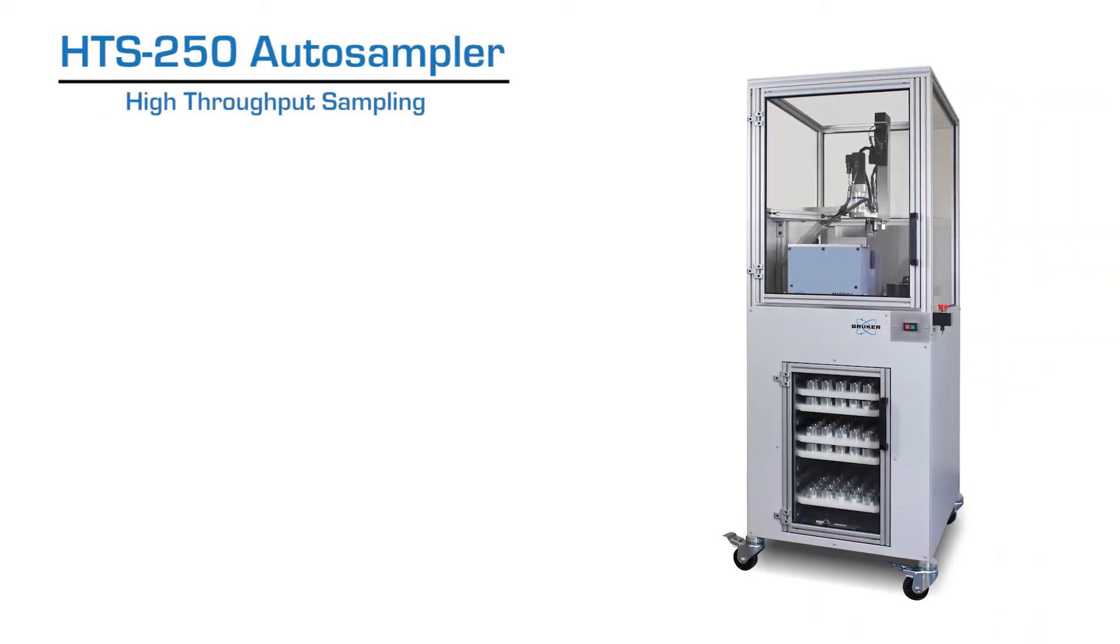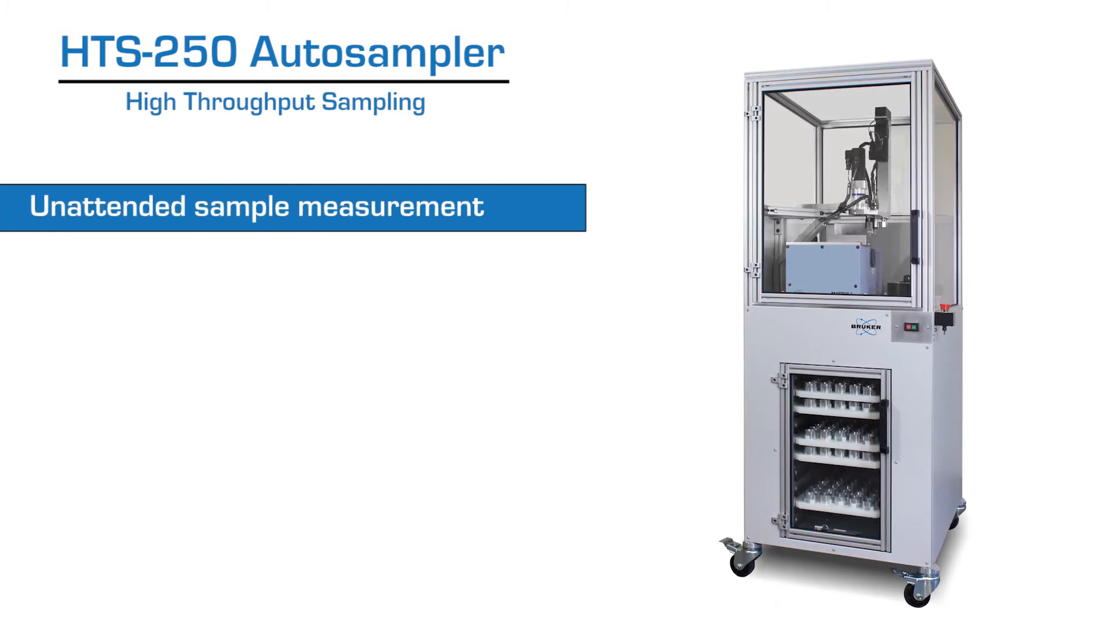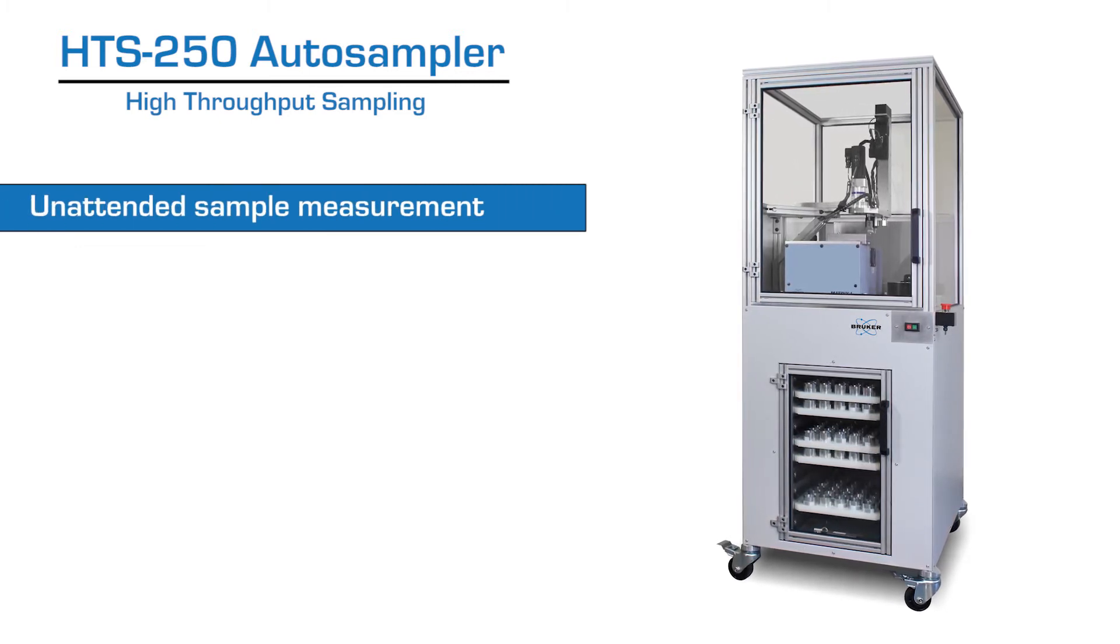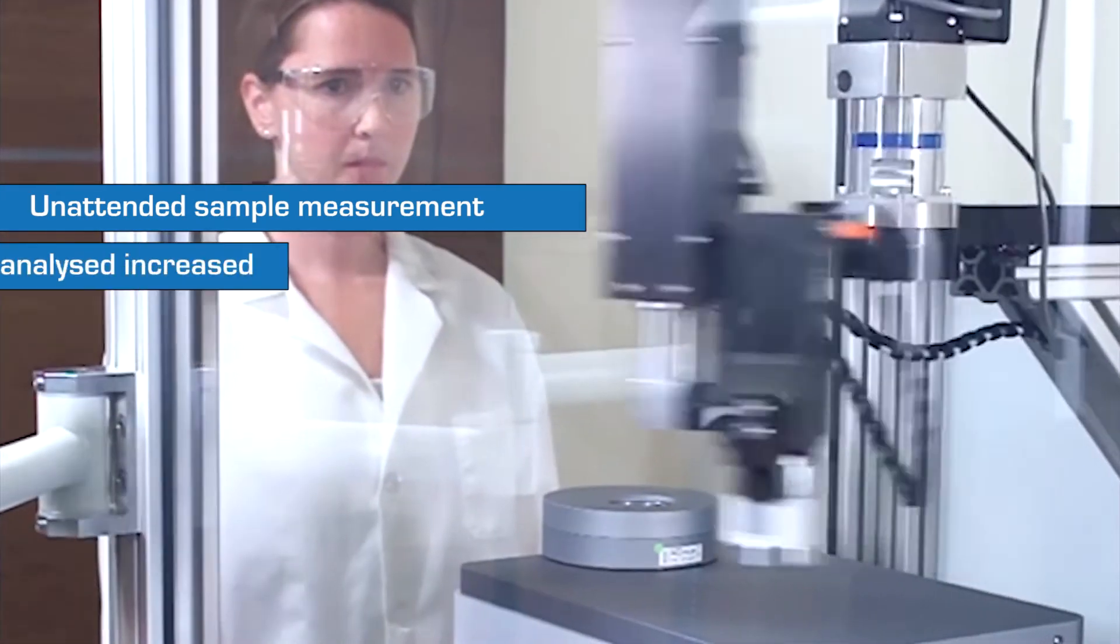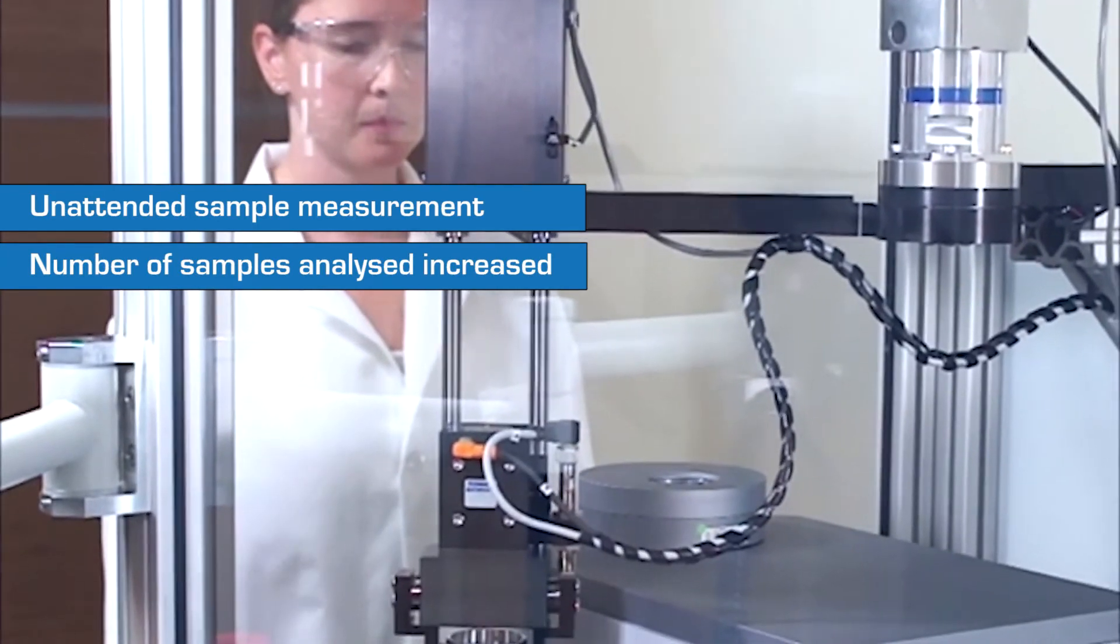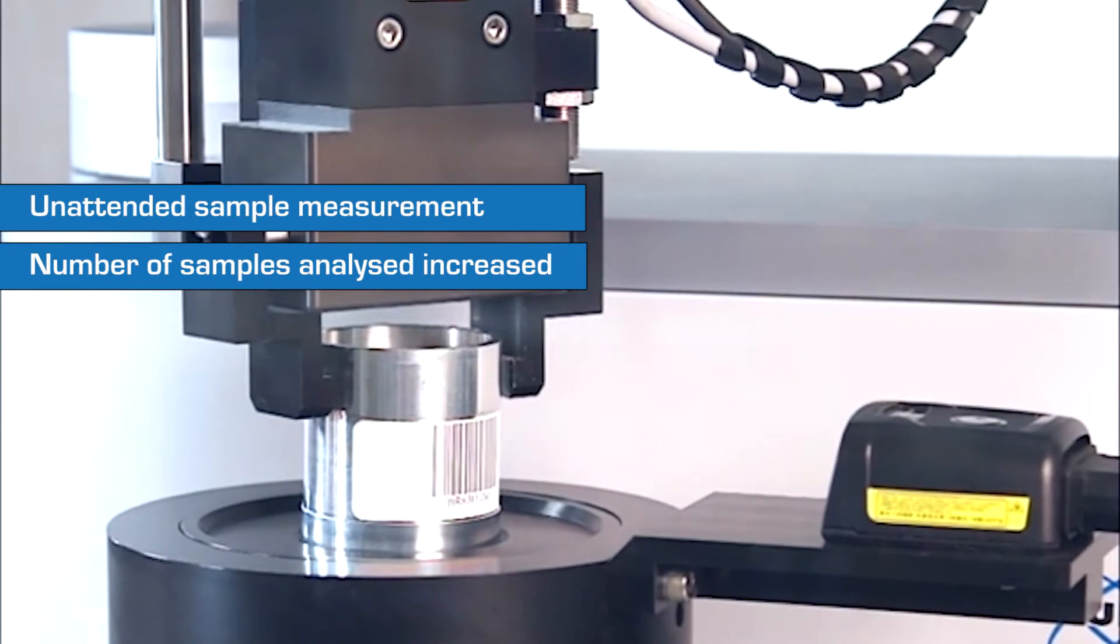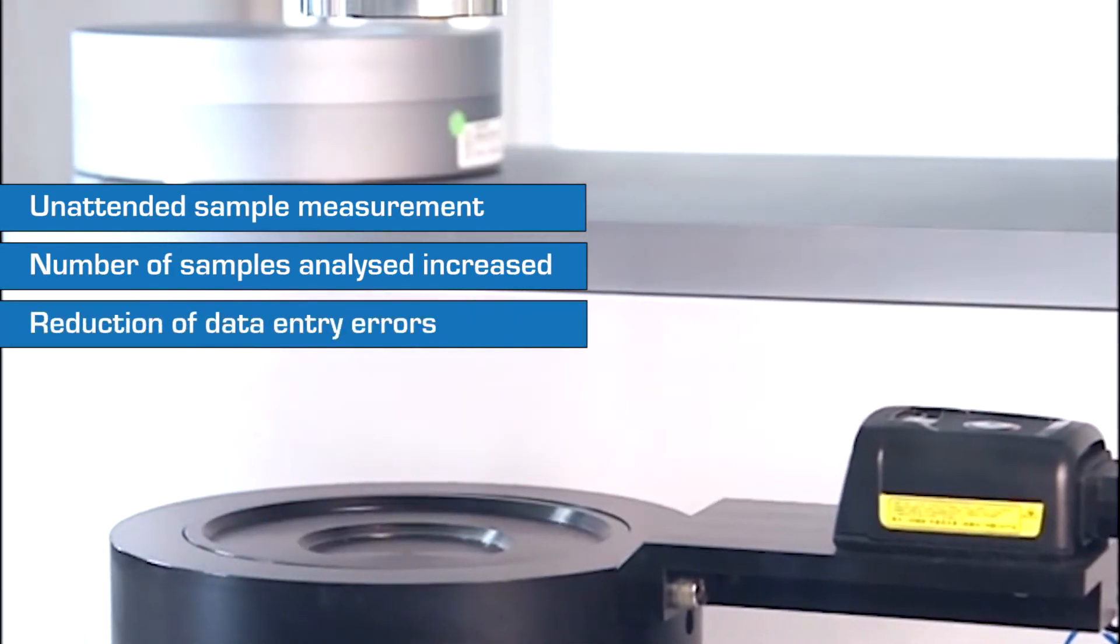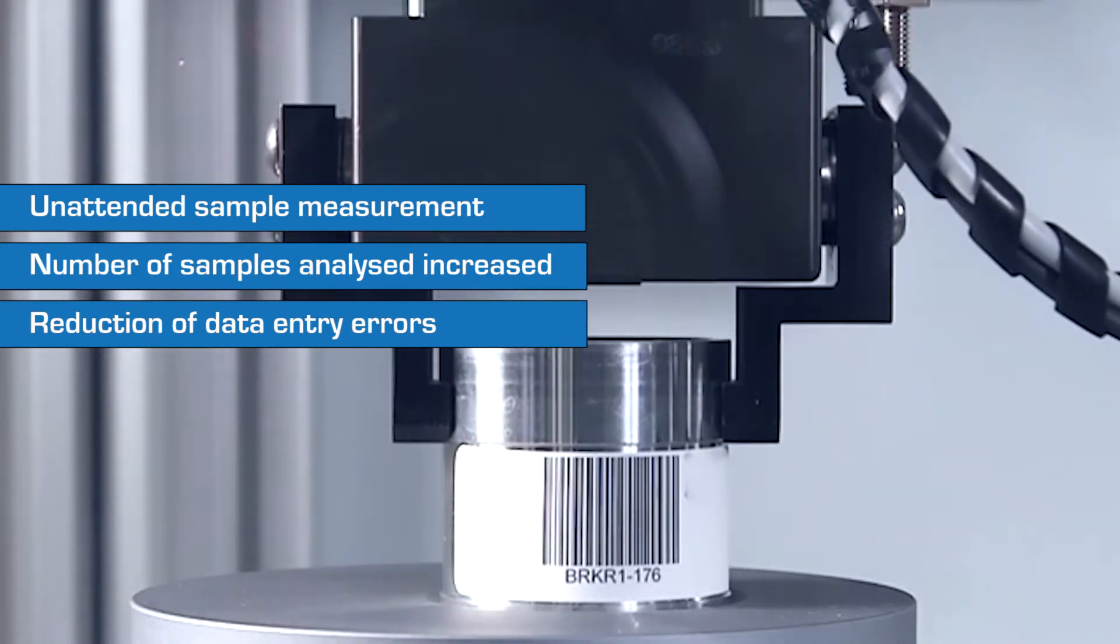Some of the benefits of the HTS 250 include unattended sample measurement and evaluation, freeing laboratory staff to focus on other value-added activities, significant increase in the number of samples analyzed from an individual ingredient delivery or product batch to more accurately profile consistency and quality, and reduction of data entry errors by decoupling data entry and sample measurement functions.